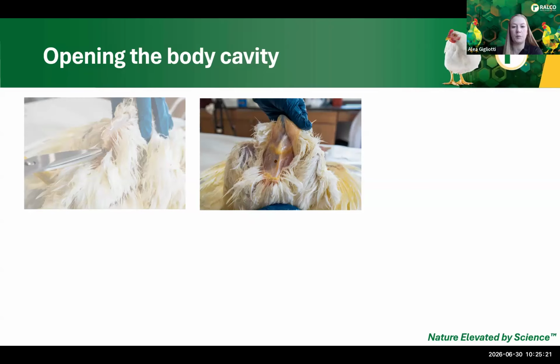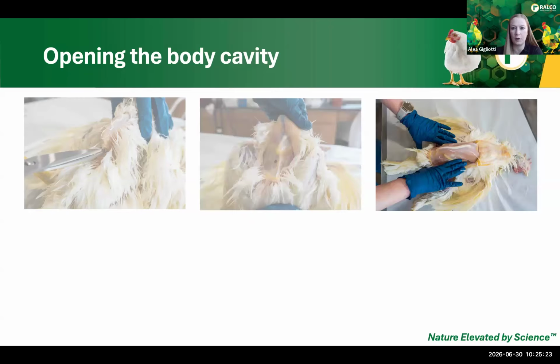And these should look pretty similar to what you're seeing in the grocery store. When you go to a Walmart or a Hy-Vee, looking at the boneless, skinless chicken breasts from the store, you should be seeing something that looks relatively similar. No lesions or blood spots, no striations or white striping.